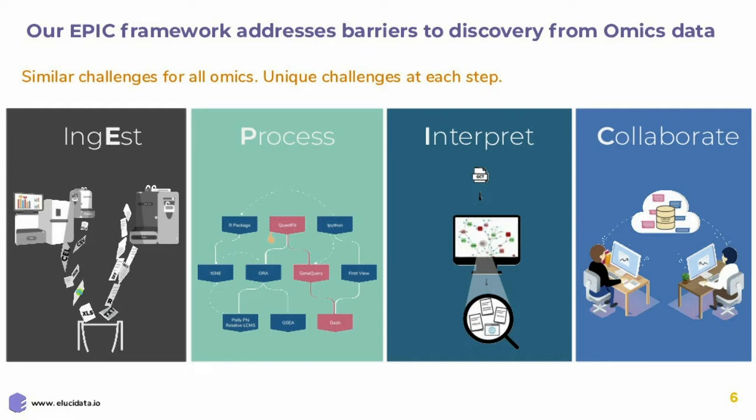What we call that EPIC. EPIC stands for ingestion, processing, interpretation, and collaboration, which indicates the 4 stages of the life cycle of any omics data sets. There are a lot of challenges.